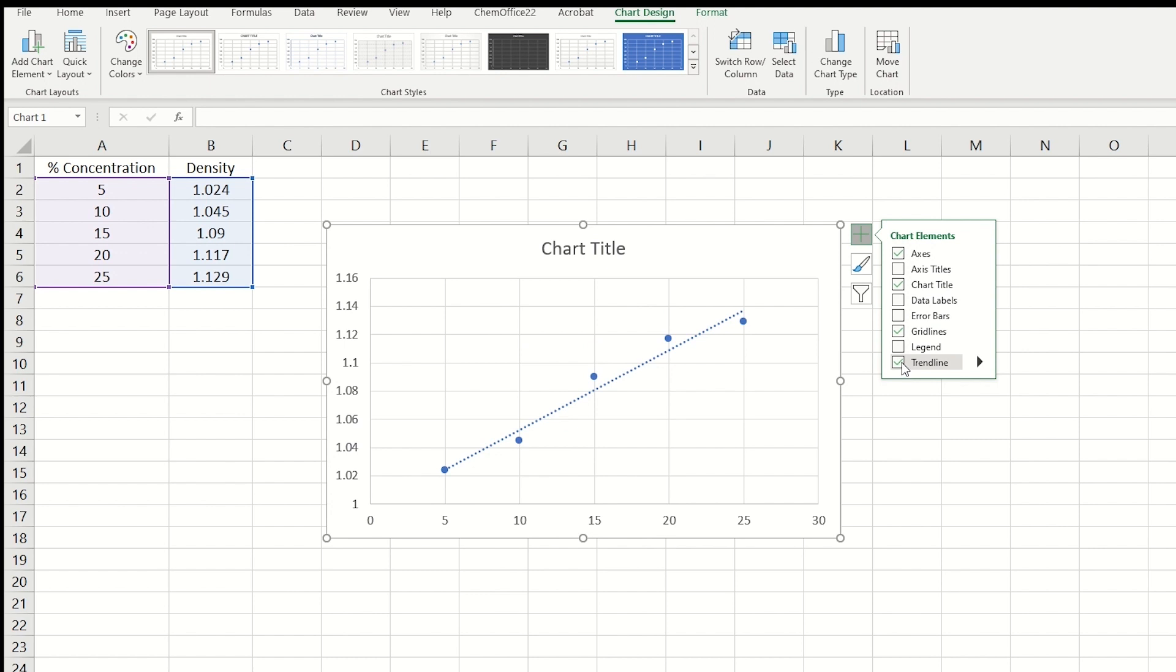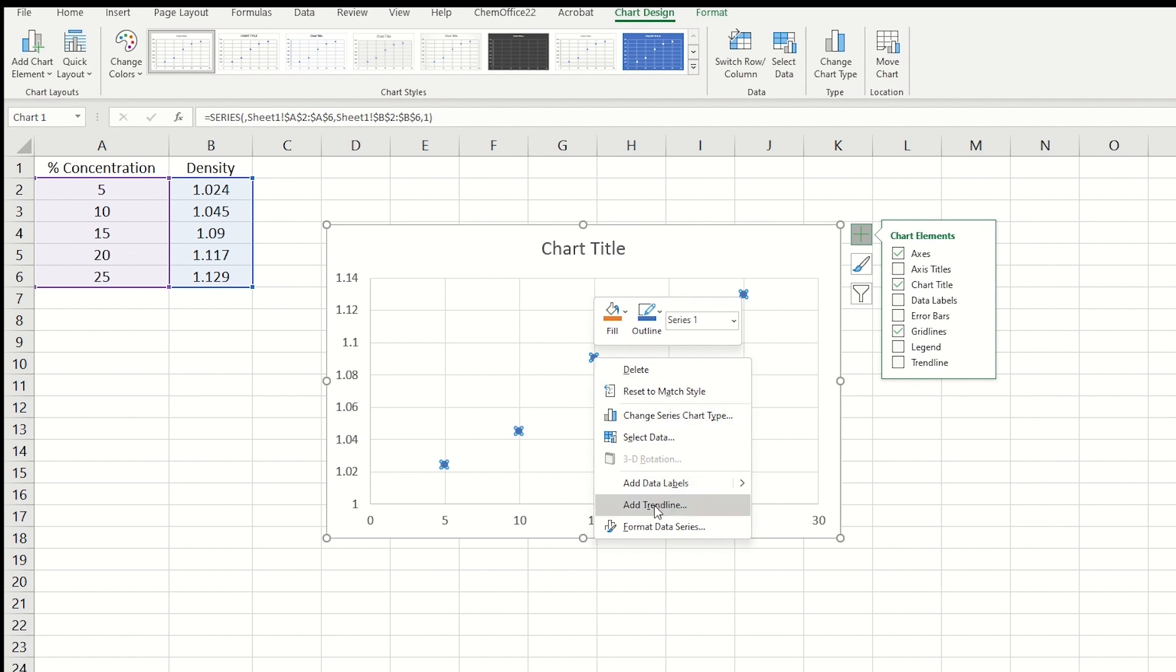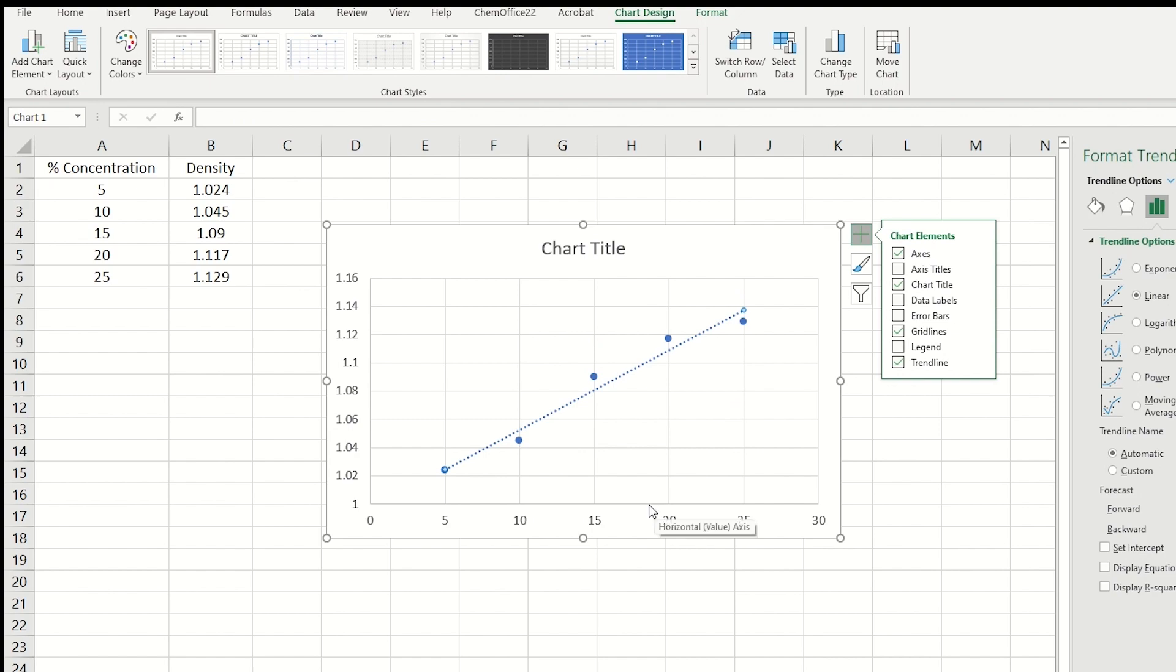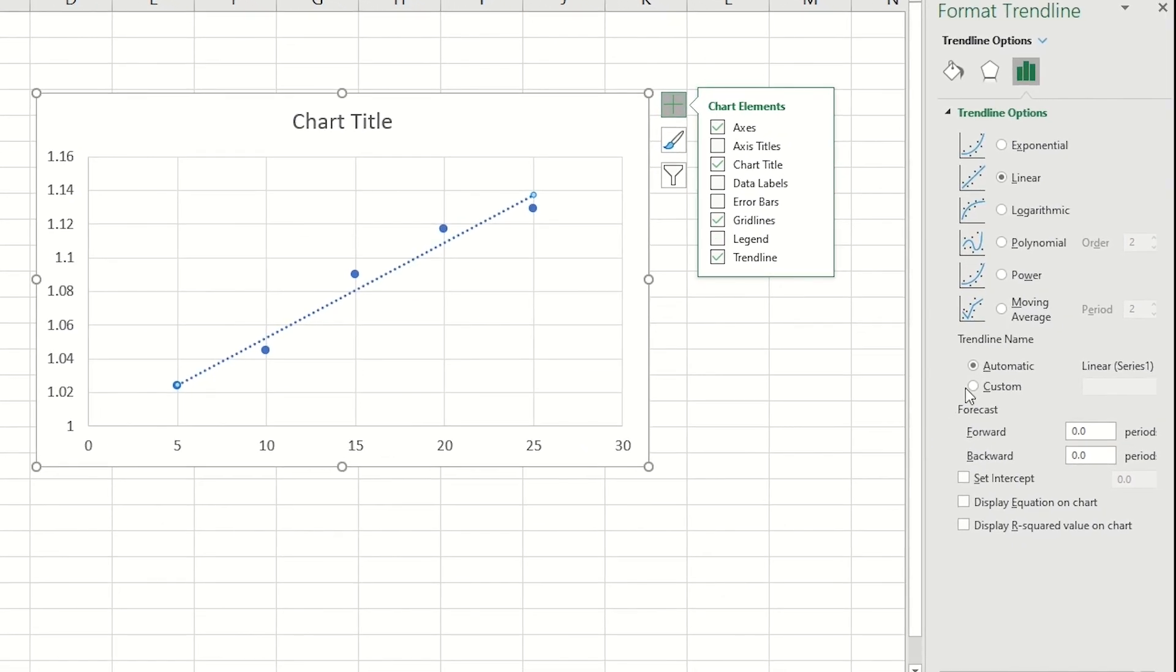I'll uncheck the box, and I want to show you another way to add the trendline. I'll right-click one of the data points and click Add Trendline. You'll notice the option box appears on the right. You have the option to fit different types of lines, but Linear works best for us. Toward the bottom, you'll see an option to display equation on chart. Click this box.